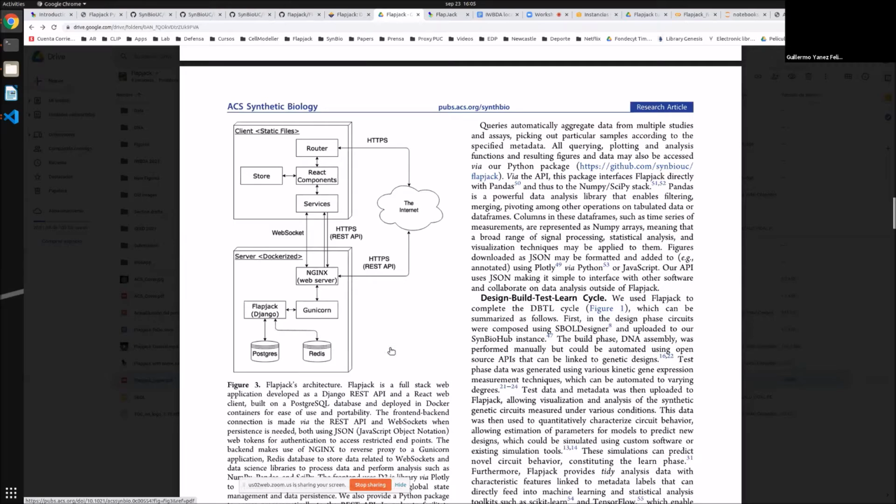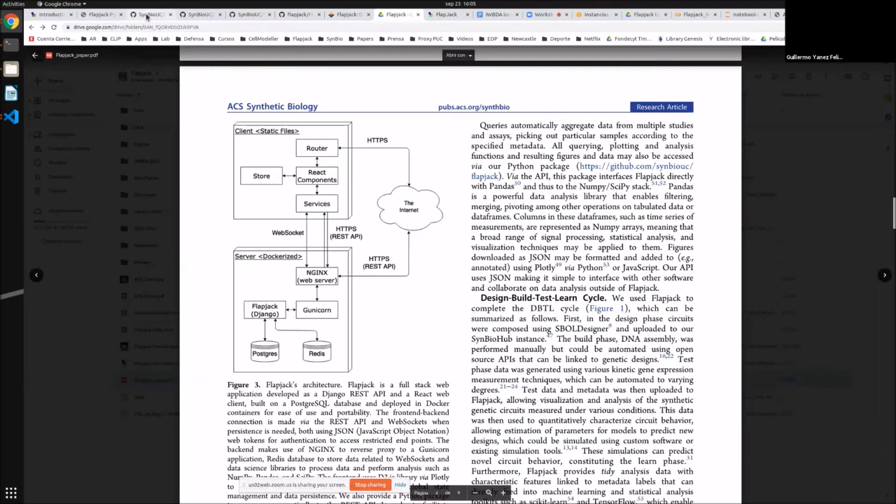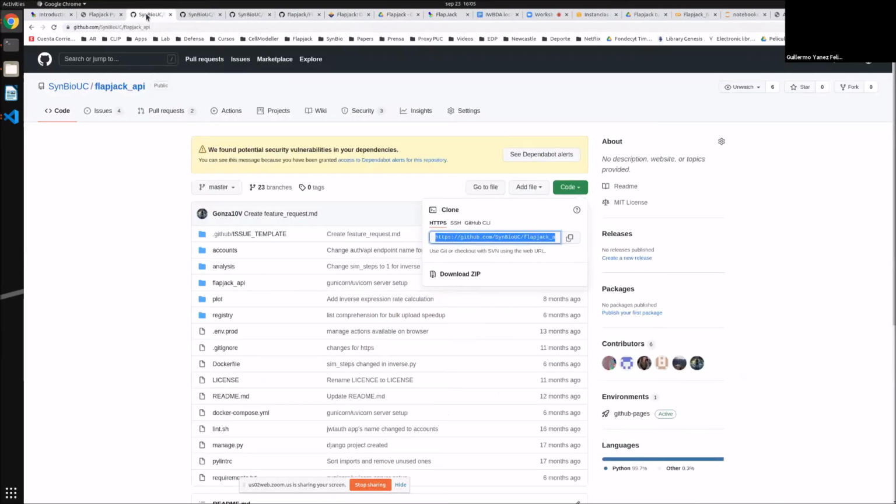But if you have a server with more than one application, or you're exposing different web services, etc., you may want to organize your proxy outside of all of these applications, and make Nginx configurations for each of them. So we are not using that architecture now.